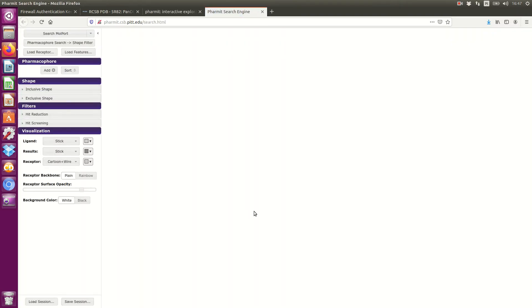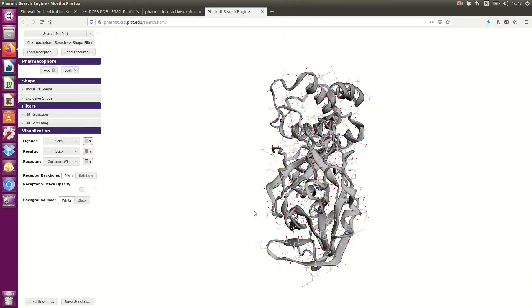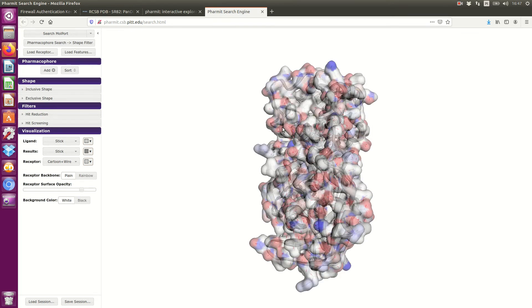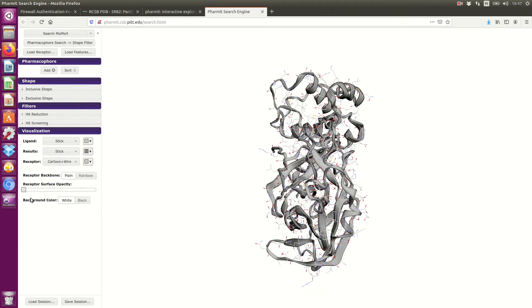Wait a little bit. You can see the molecular target. To improve the visualization, you can choose options here.